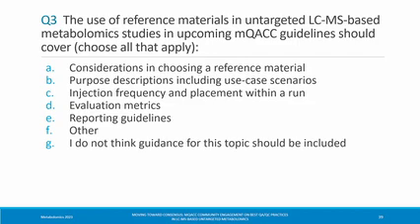All right, excellent. Thank you, guys. That was an excellent series of responses. I'm going to pull out a couple of things because it's going to lead into the next follow-up question. You actually saw in the presentation that we already gathered information about barriers, but that was a small sample set, and we have more people here, and we think this is really important. Just in the responses, cost and availability, which are two of the biggest barriers, came up. So I just want to ask you guys, you now have the low-hanging fruit, so feel free to use that. But what barriers, in your experience, inhibit reference materials use?